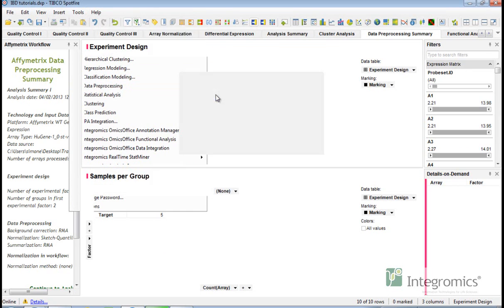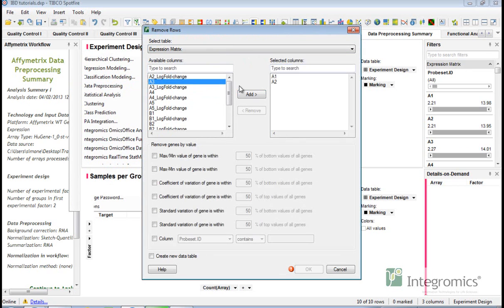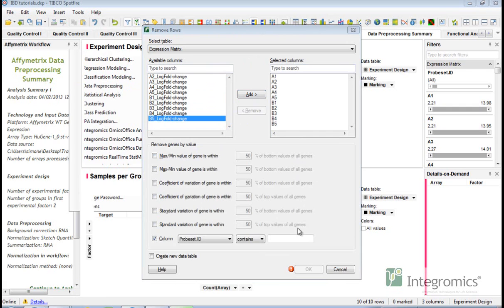Using Remove Rows, it is possible to delete a set of records from a selected table by making use of filters based on removing non-significant patterns. These filters are designed to prepare the data for subsequent analysis, for example, clustering. This operation can be undone from the Undo functionality.